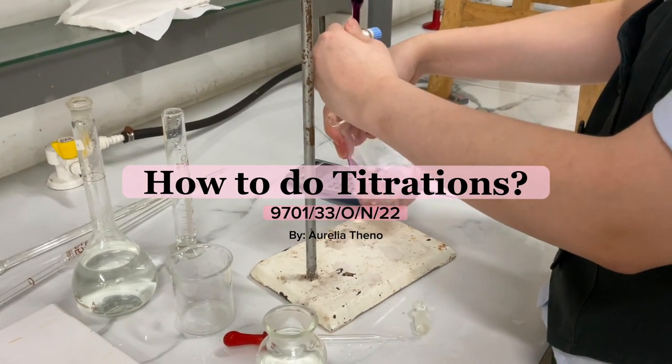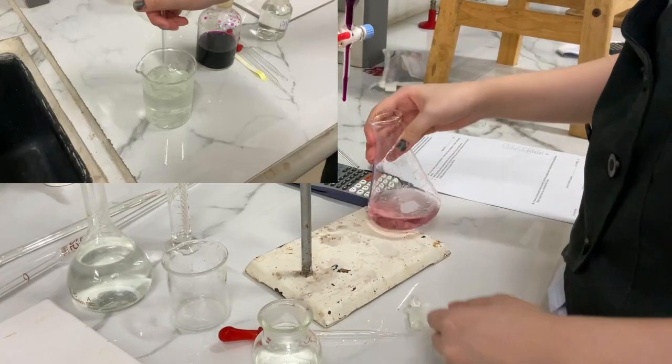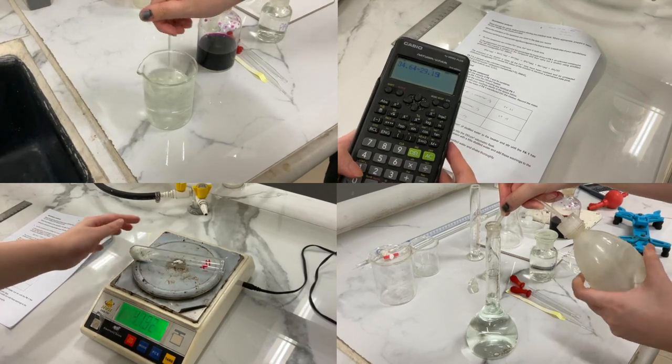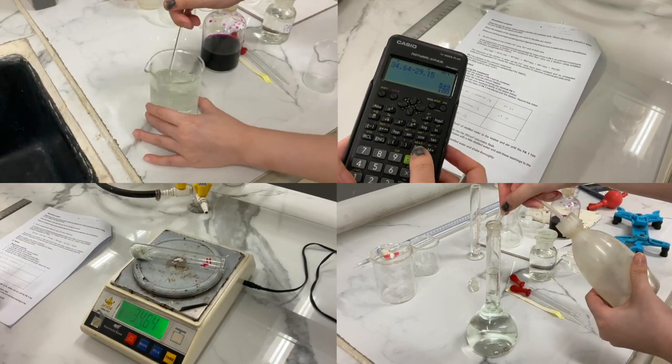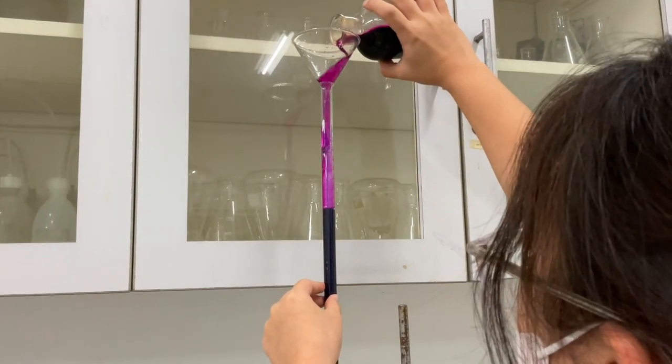Hi everyone, today's video will be on how to do titrations for Paper 3. This video will cover the procedures of titration and how to tabulate the data, along with some tips and tricks along the way.